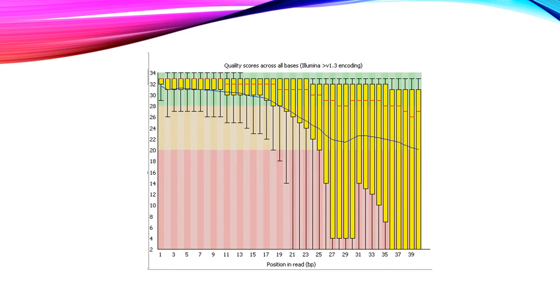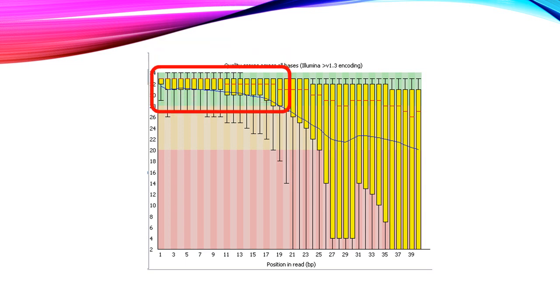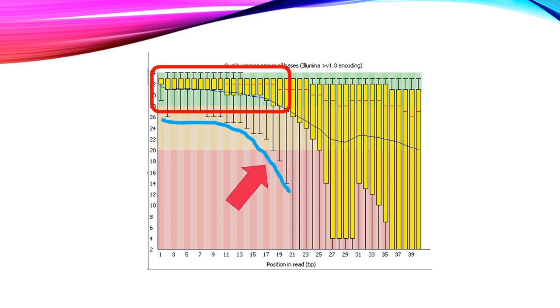FastQC is an important tool which can be applied to determine the Q-value. As you can see, the reads within this particular bracket represents high quality reads with a good Q-score, whereas these are reads with poor quality. As you can see, as the sequencing reaction proceeds along the specific DNA fragment, the read quality tends to drop.